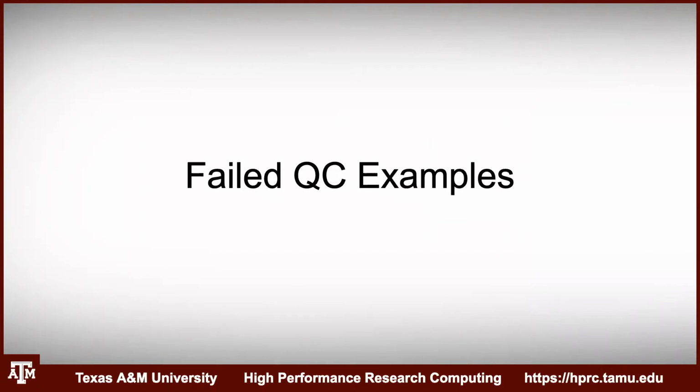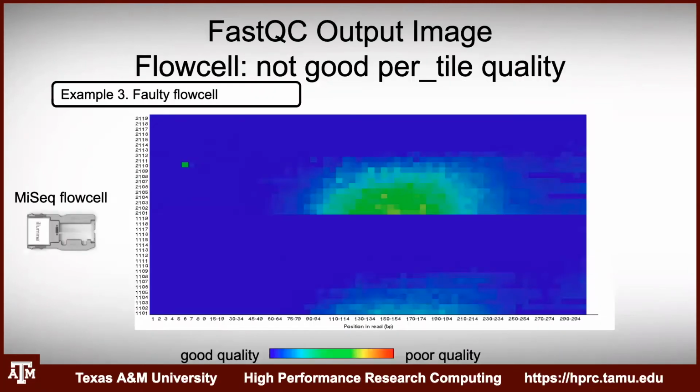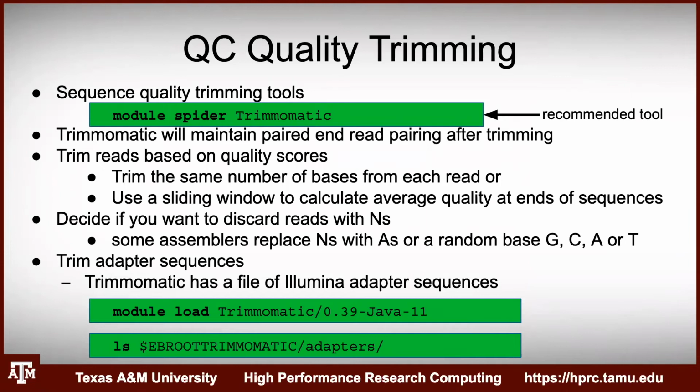And it's not proper bioinformatics if you haven't done it more than once on the same sample. So it's always good to play around with parameters and things like that to get the best results. There are a number of tools available for trimming. This is one of the recommended tools, Trimmomatic. I like this one. I also like Cutadapt. That's a really good tool.